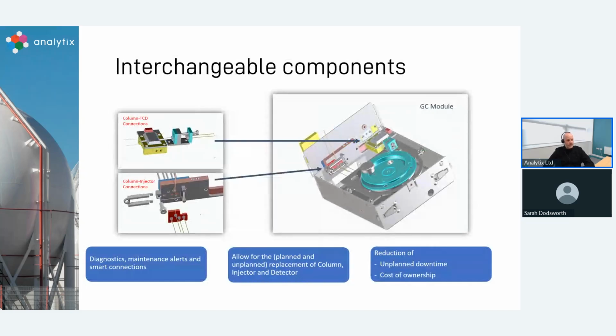Anybody that's familiar with the previous micro GC models like the 490 or the 4900 knows the columns, or the channels, had to be replaced as one. When Agilent redesigned this system 4 or 5 years ago, one of the big goals was to make the components accessible, not just for service engineers but also for customers, if we needed to change certain parts. We can now change each of those components that I showed you on the previous screen independently.